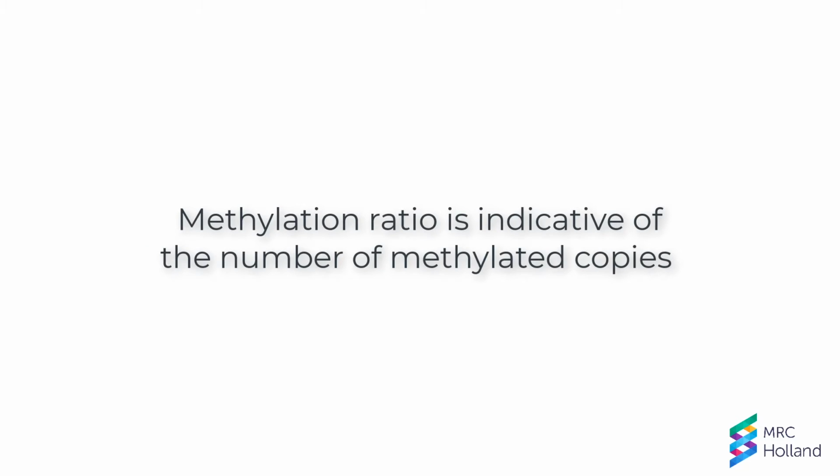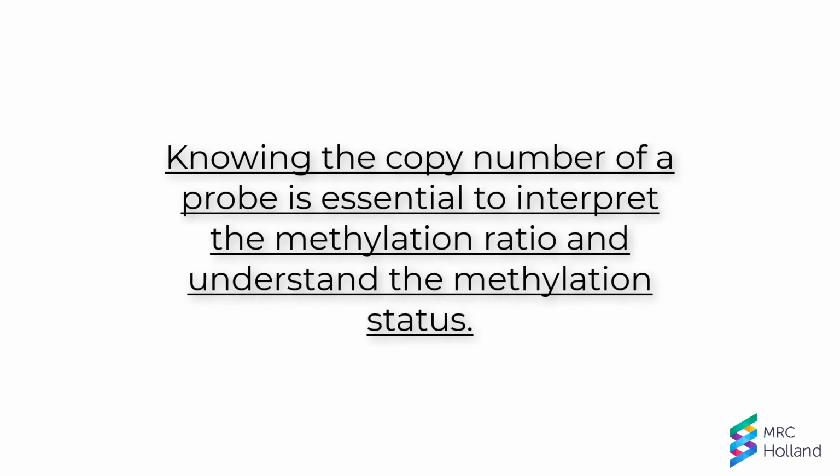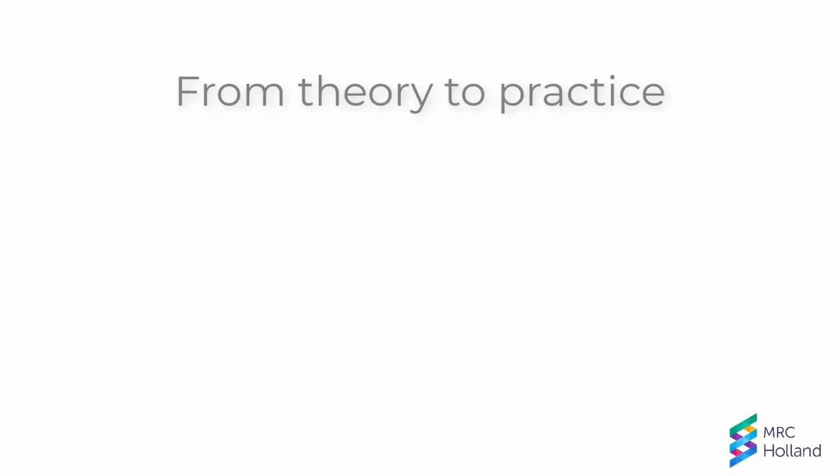The calculated methylation ratio of a methylation-specific probe indicates how many copies are methylated in a sample. Therefore, you first need to know the copy number of a probe to understand its methylation status. To see how this works in practice, I will give an example and explain how to interpret the results.